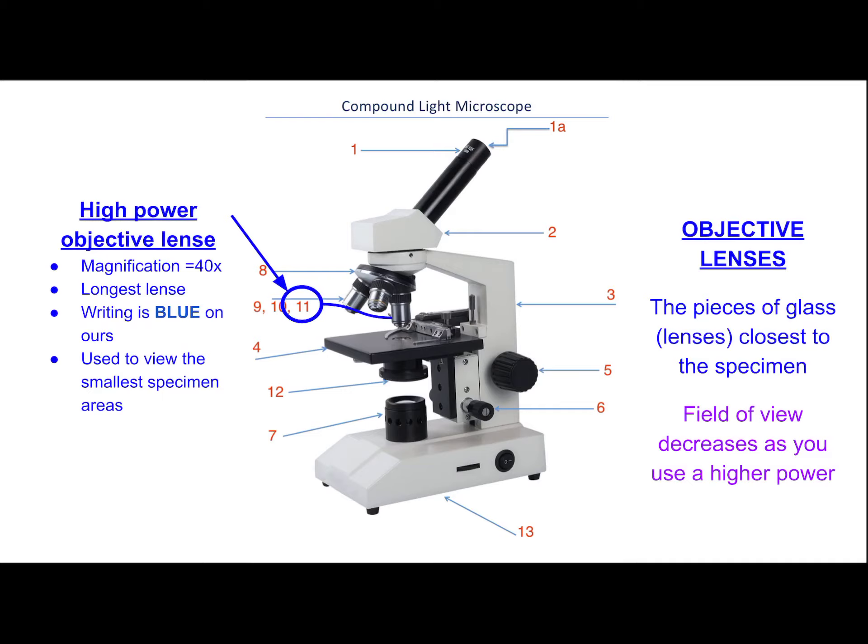When you're done with the microscope, it's important to put it away properly. Wind up the cord — there are places on the back to wind it — and do not wind it around the light source. Then replace the dust cover before using two hands to return the microscope to the cupboard. There are numbers on each microscope, so please place them in the correct spot in the microscope cabinet.